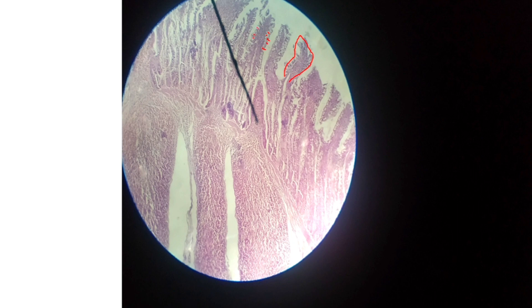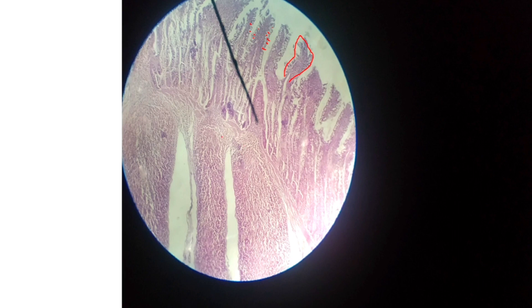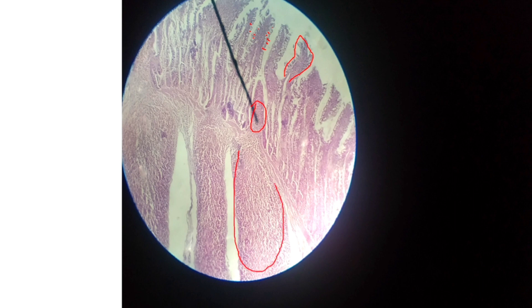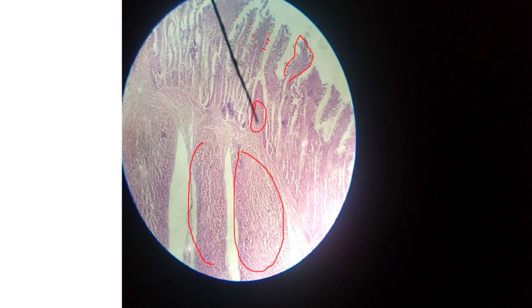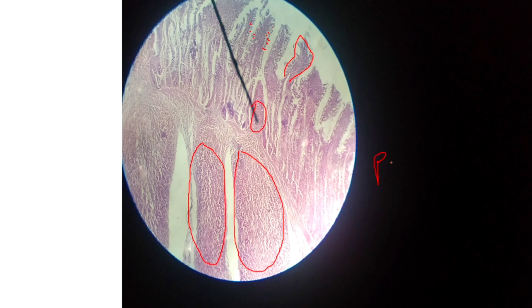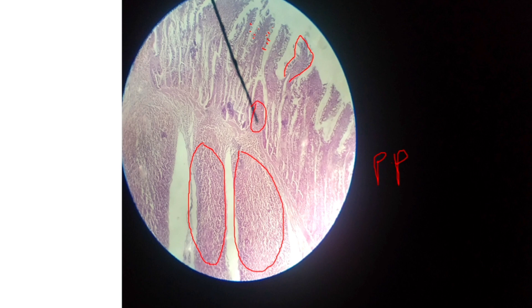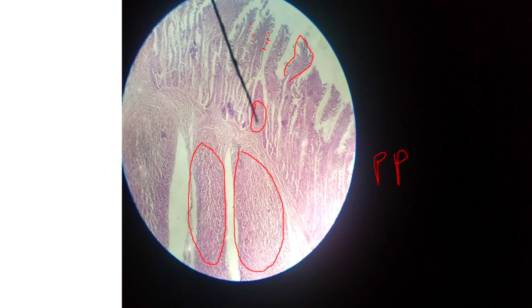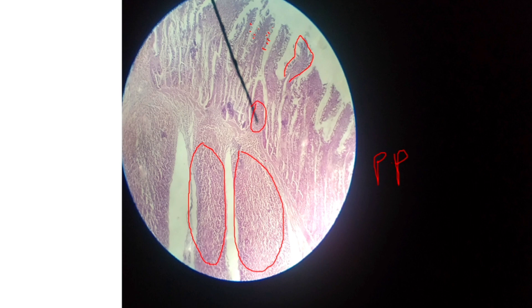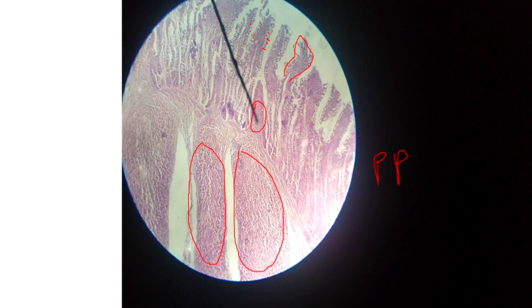Goblet cells. Goblet cells are found in both small intestine and large intestine. This pearl-like structure is a goblet cell. And this is the lamina propria. A unique feature: what is this? Peyer's patches — aggregation of lymphatic follicles. Lymphocytes aggregate here to form lymphatic follicles, called Peyer's patches. They extend from the lamina propria to the submucosa of the ileum. This is a unique feature for ileum, which helps to identify the slide.